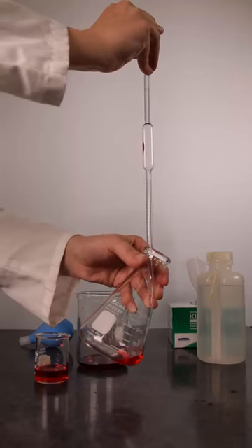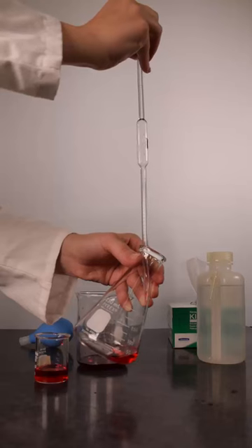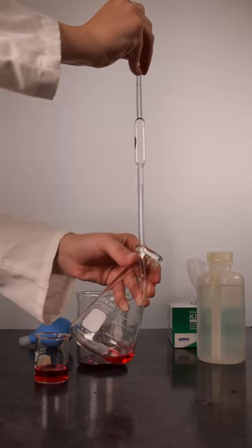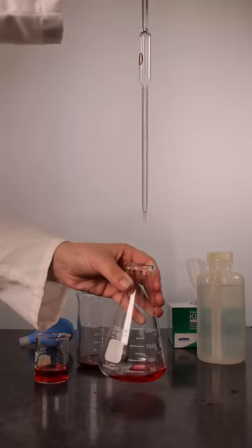After counting to 5, keep the pipette tip in contact with the inside of the flask and rotate the pipette 360 degrees. This ensures any drops on the outside of the pipette tip are transferred to the inside of the flask. After rotating, break contact between the pipette tip and flask and then remove the pipette.